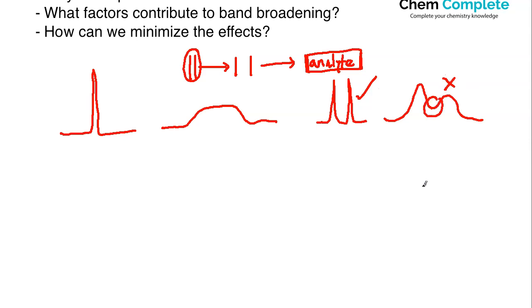Especially if we're not returning to that baseline or as close to the baseline as possible. And so one of the big issues, as I just said, is when you're trying to purify the analytes, you could end up having the analytes mixed together. Okay, so analyte mixing. And that's obviously an issue because when we're doing chromatography, the general goal of chromatography is analysis, but it's also purification. It's separation of materials and analytes from one another.